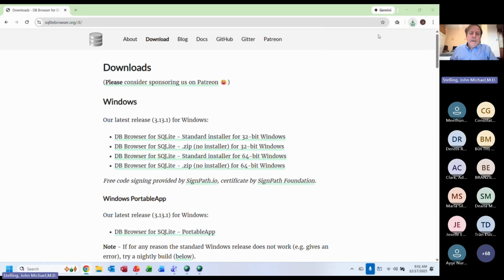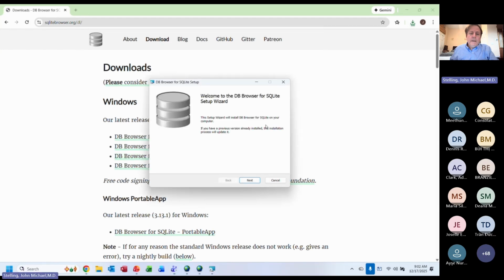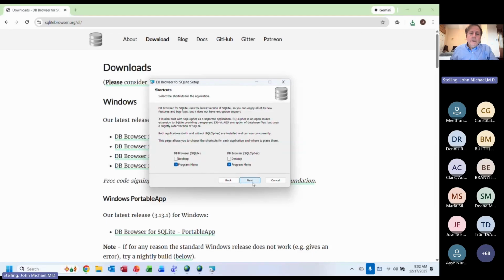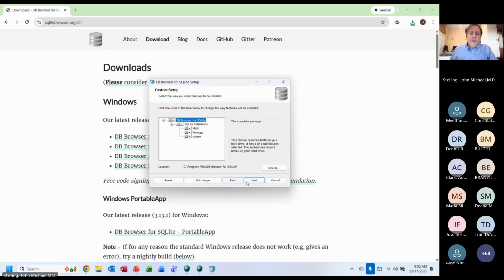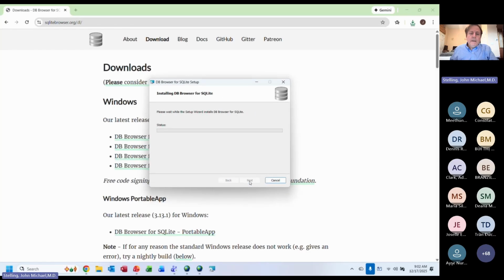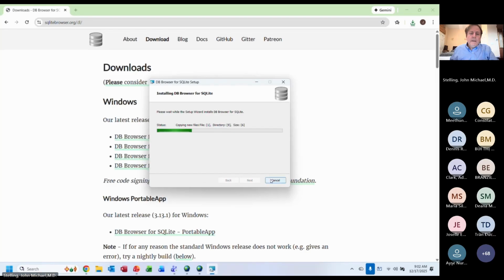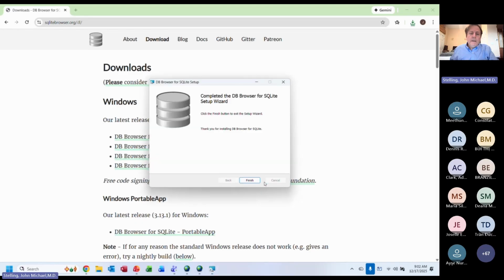We don't recommend this for most people. But if you are a data manager, if you know Microsoft Access, if you know SQL Server, Oracle, MySQL, just install this software here. And this will allow you to edit your WHONET files, in WHONET, of course.